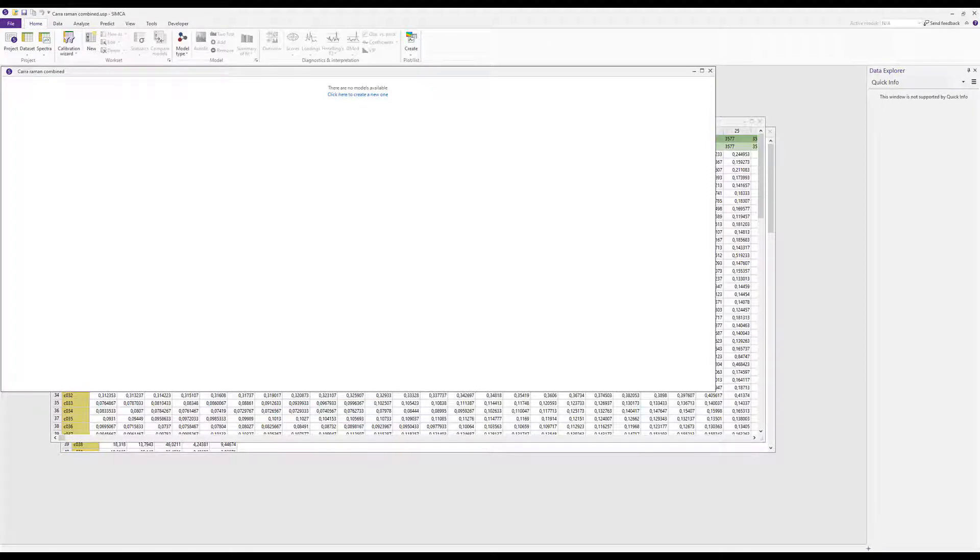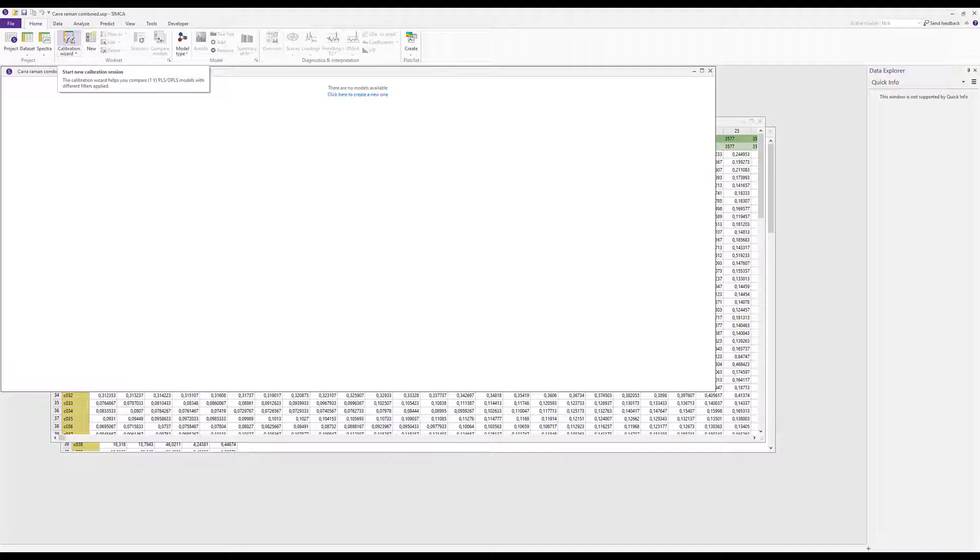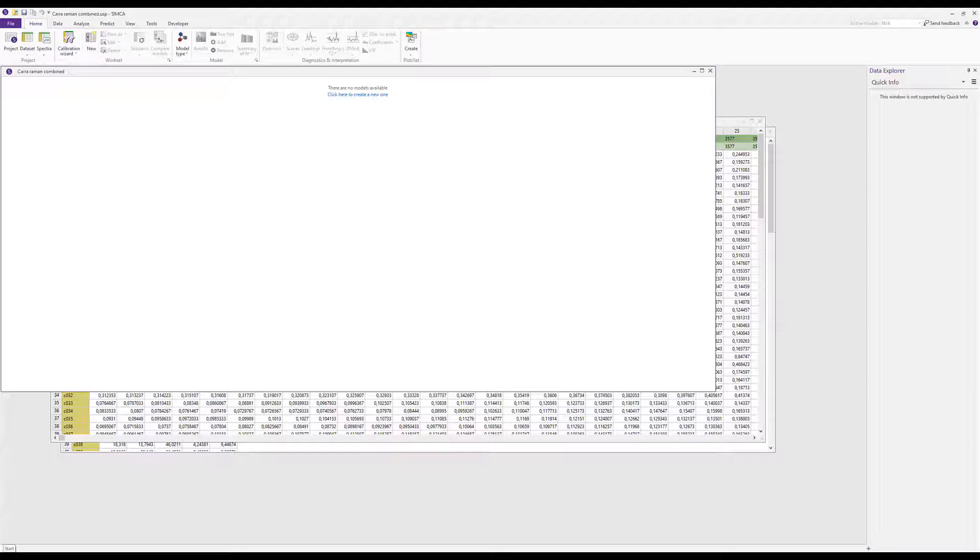When SIMCA detects a data set with a spectral ID defined, it automatically introduces some special spectroscopy-related buttons. There's a spectra button and a calibration wizard button, and later on we'll see some more buttons appearing. All this functionality is triggered by the spectral ID. It can be good to know that you can set this and change this later on inside SIMCA, not only in the import.